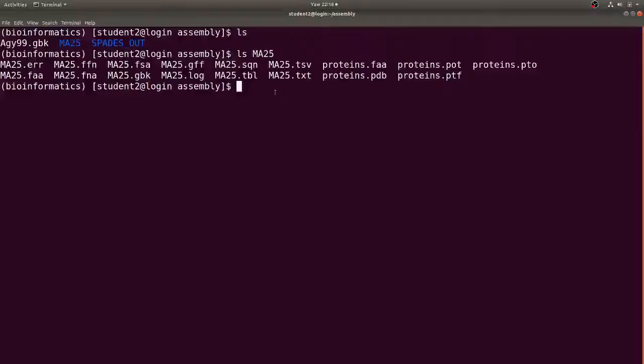So for example, if I want to find the number of protein coding regions, then I can find them here. Of course, there's another file here that gives a summary of each of the features and then lists them. So you can also have a look at this one quickly. But for this one, I'm going to use this and then this. So you can use some Unix tricks and commands to find some information of the annotation that we did to help us interpret and understand our genome. If I want to find the number of protein coding regions, I can use grep and I specify a directory, then the file, which is .faa. Now, because I want to count, I have to use the pipe command and then add wc -l to count them. And so once we do it, we have this. So we have 5,421 coding regions.